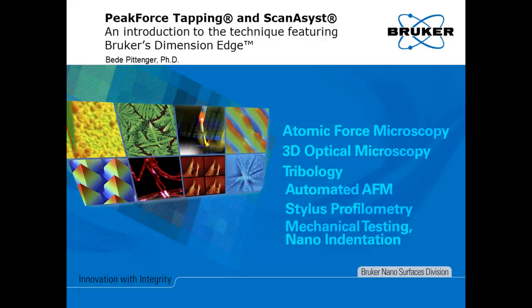Thanks for the introduction. I'm Bede, and I'll be discussing PeakForce Tapping with ScanAsyst, a mode that has been available for some time on the Dimension Icon, but has only been recently released for the Dimension Edge.